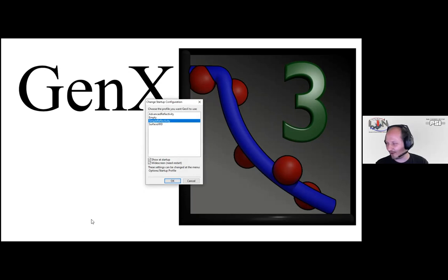Because the paper is outdated, I won't show you anything. That's from 2007, but I will show you how to build that model. Because one of the improvements, or I hope it's an improvement, I made is trying to make an extremely simple beginner's kind of interface to build a model that's not so complex.